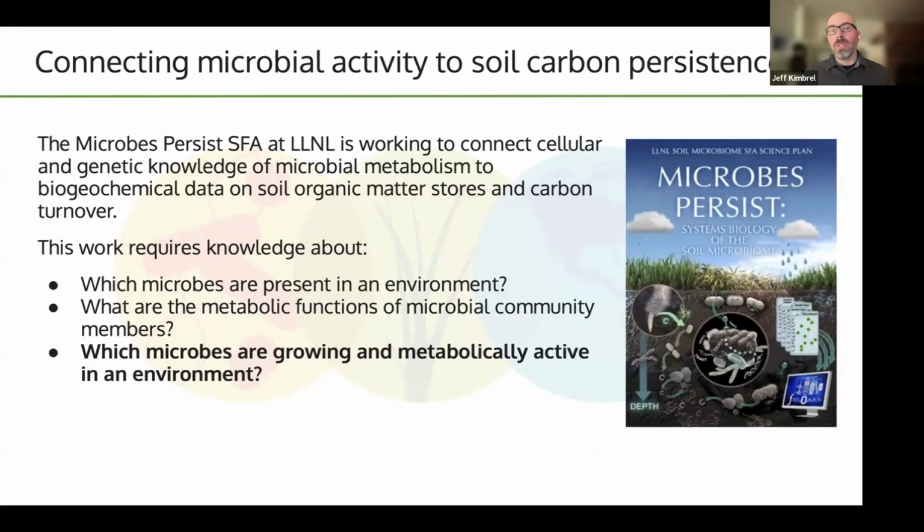So we use a lot of stable isotopes to try to track actually where carbon is flowing in an environment. Other work at Livermore works with tracking nitrogen. We image isotopes. We use a lot of nanoSIMS. So we're generally interested in how we can use isotopes to help actually explain metabolic activity, the flow of nutrients in systems.